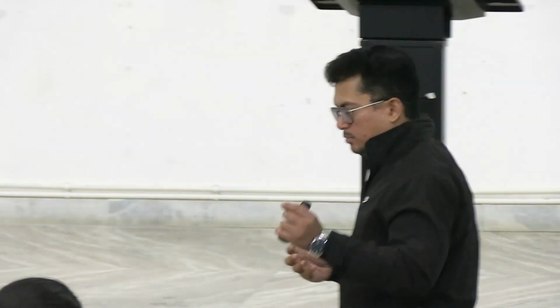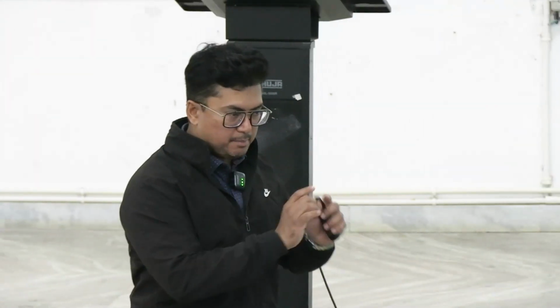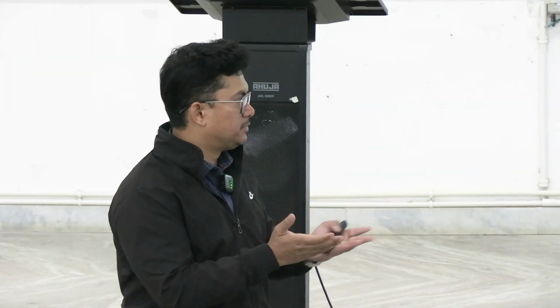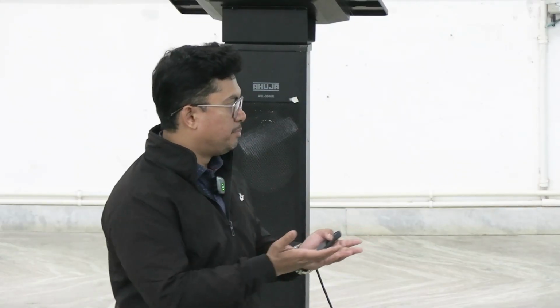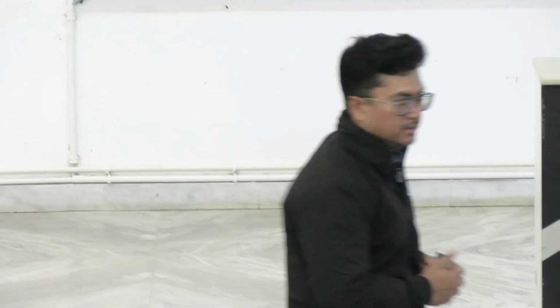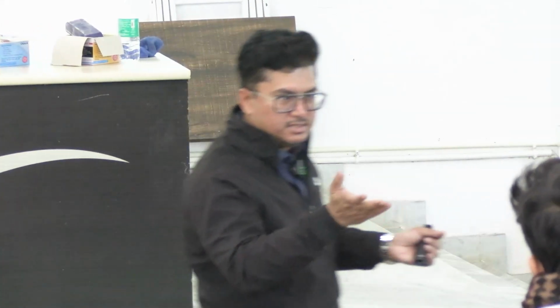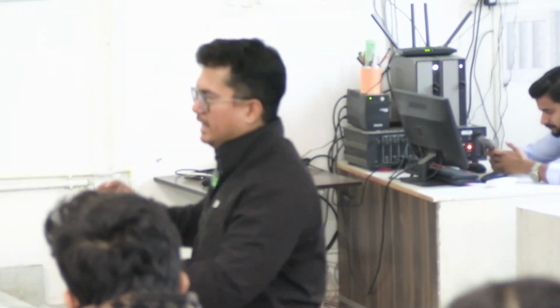কি করে ডিটেক্ট করব, আমি কি করব, একটা টেমপ্লেট দেব। Template means a kind of a preformed sequence of the nucleotides. তো টেমপ্লেটটা দেব, তার সাথে কিছু নিউক্লিওটাইড দেব, ATGC সিকোয়েন্সে, এনিথিং। Then we add some enzymes, we add some electrolytes and all these things, and we give to the machine. হ্যাঁ, তো মেশিন কি করবে?